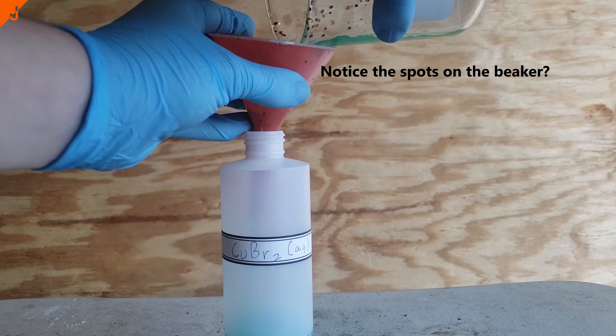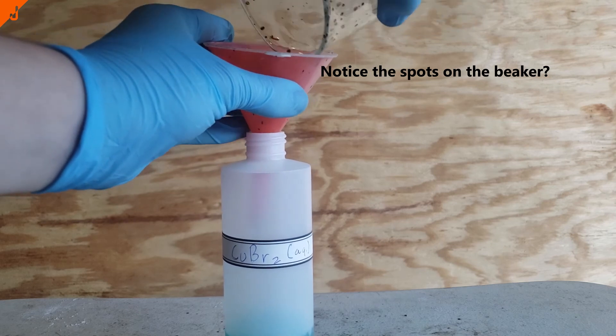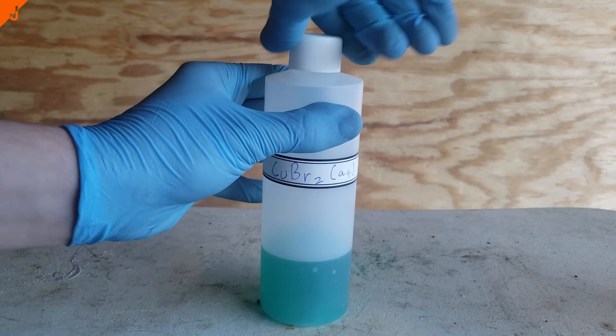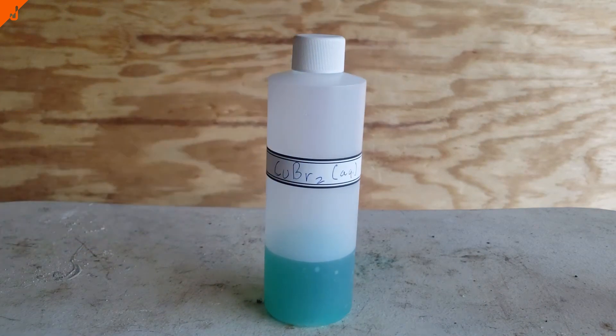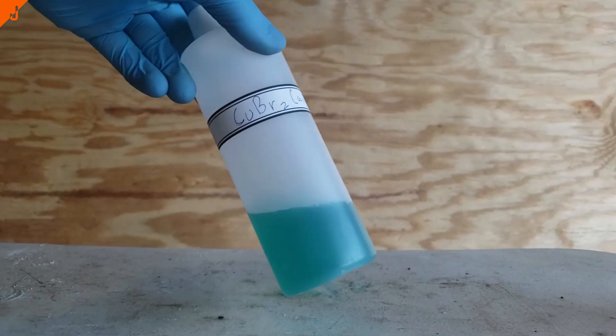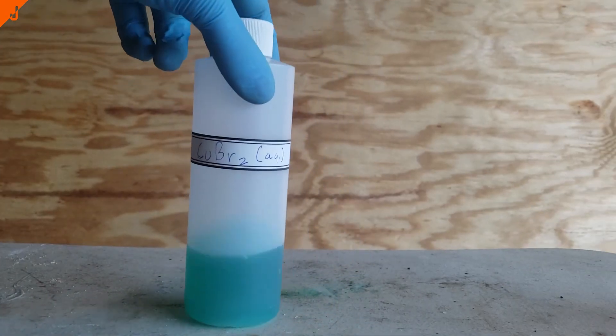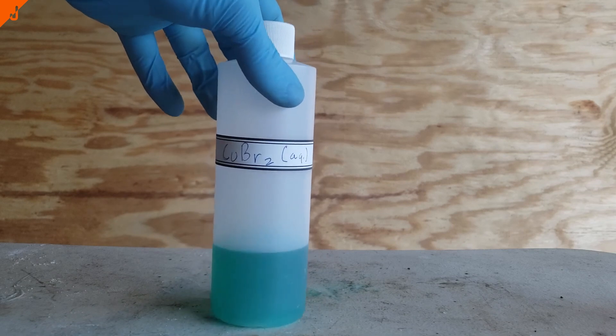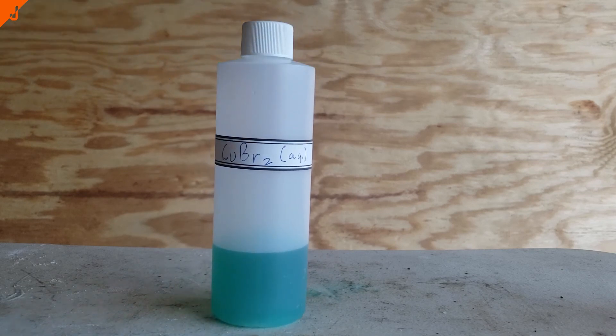Finally, once it was all done filtering, I decided to just bottle it as is. And this is because copper-2-bromide is actually, apparently, pretty deliquescent. So I really didn't want to have to deal with crystallizing it, and Wikipedia actually has some pretty crazy methods of drying it out all the way with phosphorus pentoxide.